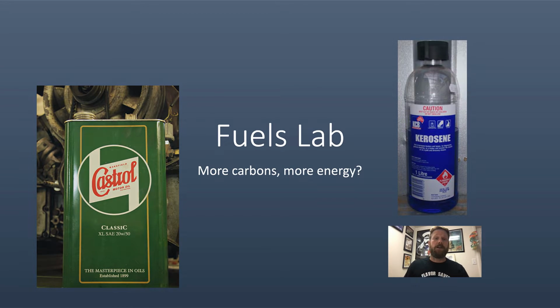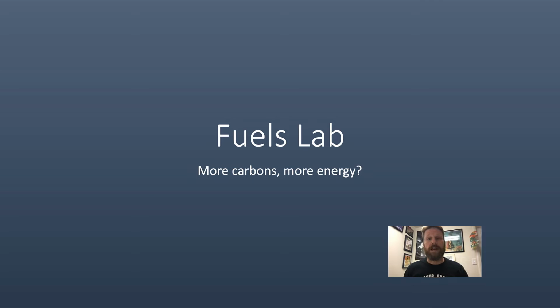During this lab, you will determine the amount of thermal energy released while burning several different hydrocarbons. Might there be a relationship between the number of carbon atoms in the molecule and the amount of energy released? That is what you will find out.